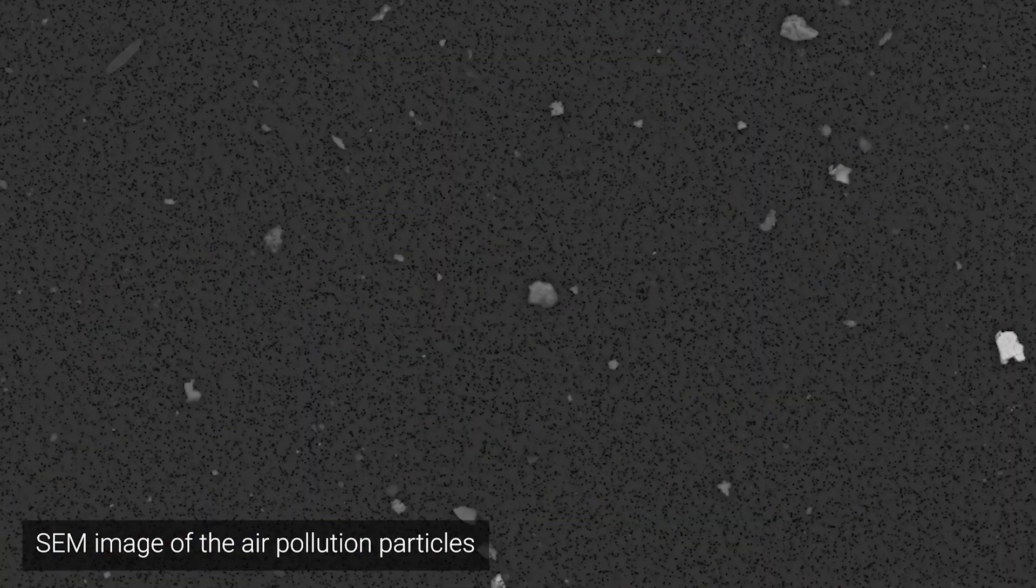Once the filter is in the microscope chamber, we can identify individual particles using image analysis, and then each particle is analyzed separately.